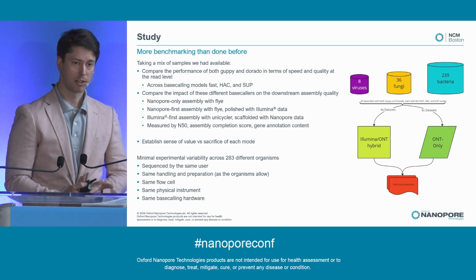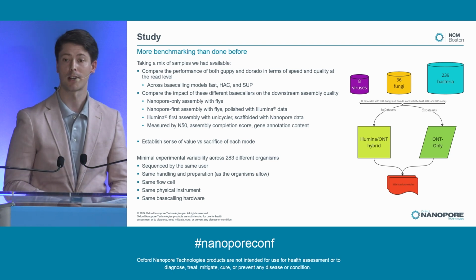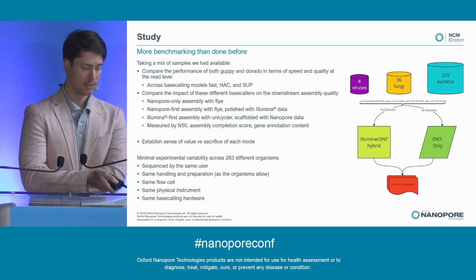From here, we took their base calling, and then we assembled them with Flye. We did a couple other assemblies, hybrid assemblies, other tools. We're not going to be talking about that today, just for the sake of time. I'm already halfway through my time limit. And we're going to look at the N50s.